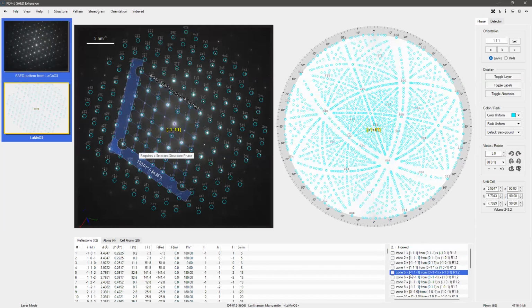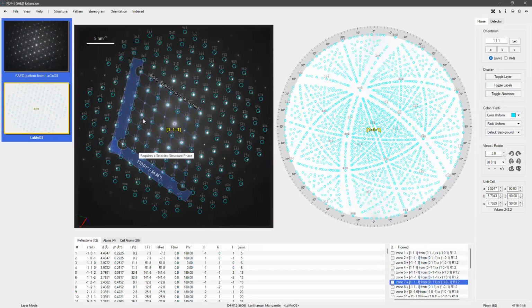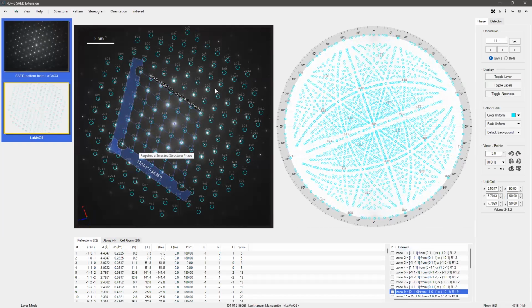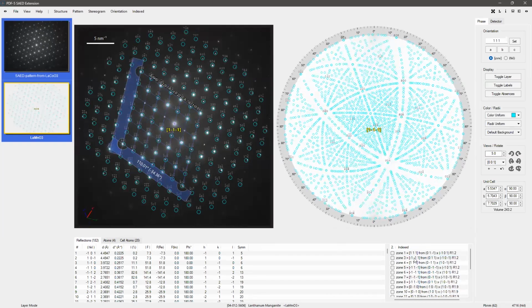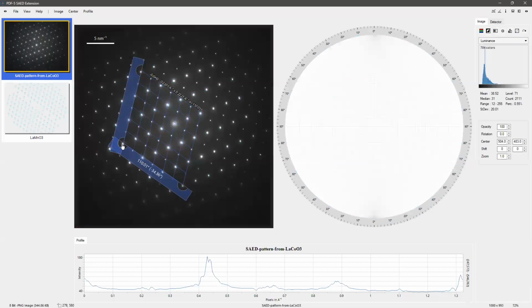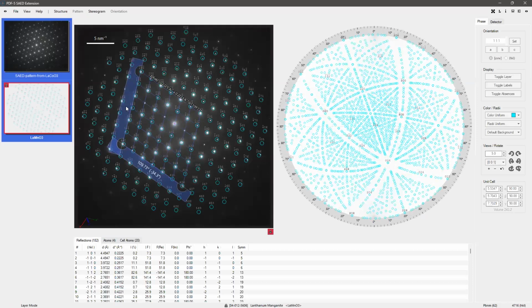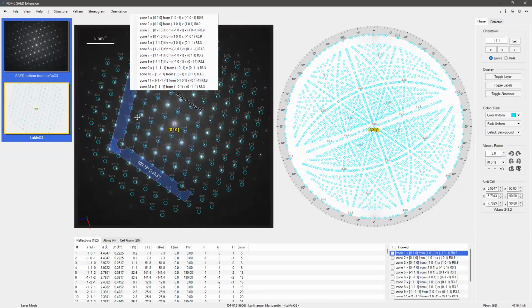from which we then can select a variety of directions. So sometimes you get more, sometimes you get fewer solutions. I would have expected to find fewer. Let me adjust the grid. Usually I only get like 4 solutions instead of such a long list. Let's see if we can get. No, we still get a longer list. But anyway, this is a list of solutions for the indexing.